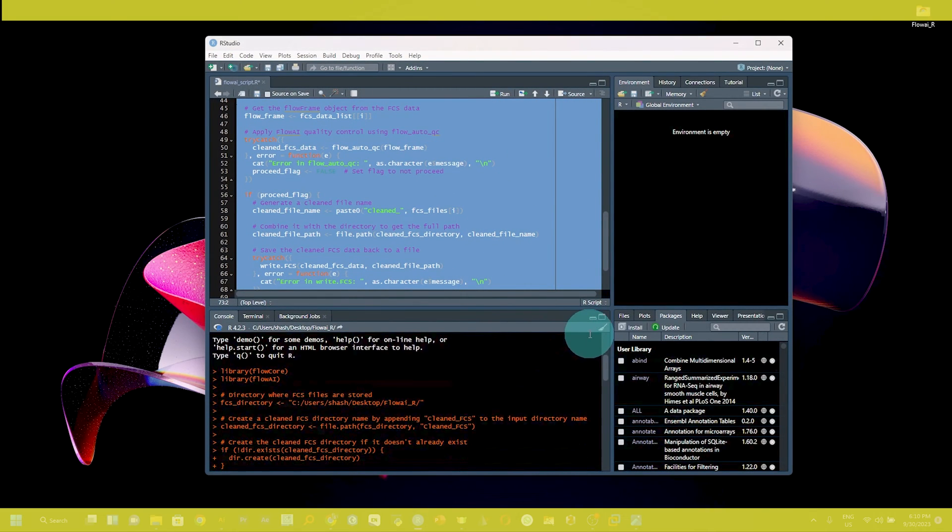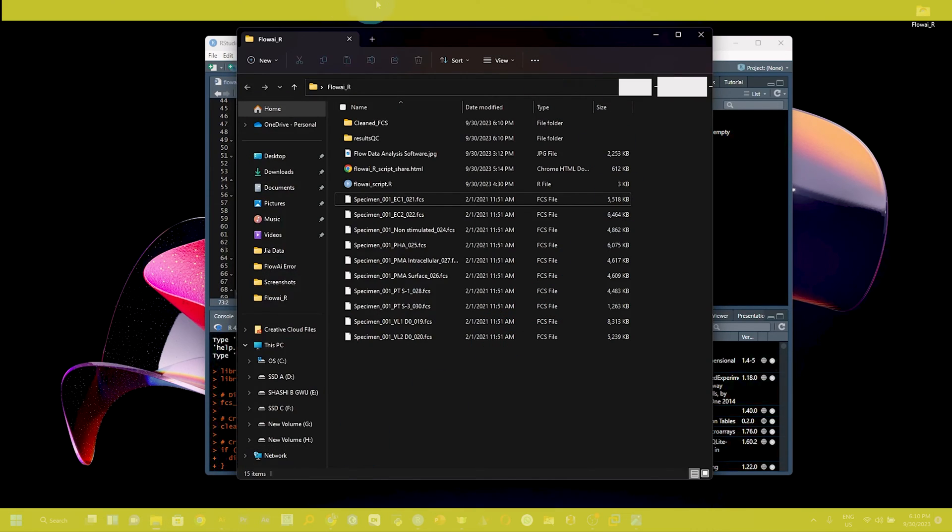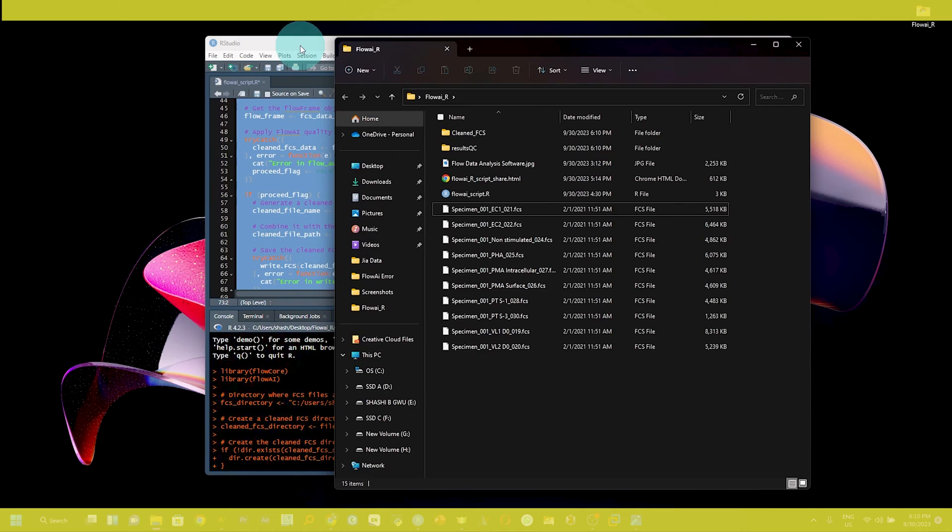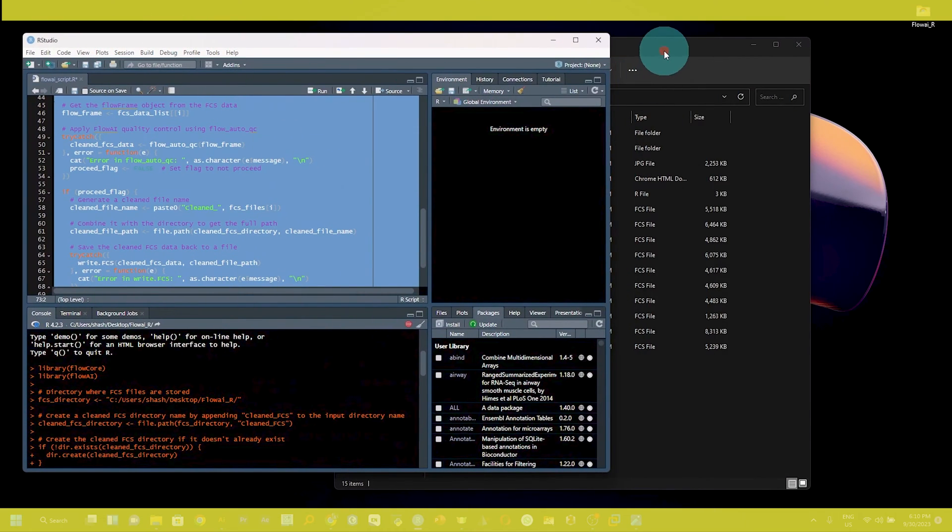Now you can see the script is running, and we can see our folder where we have saved the file.